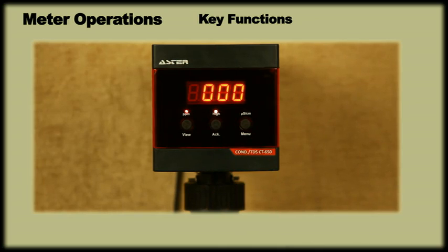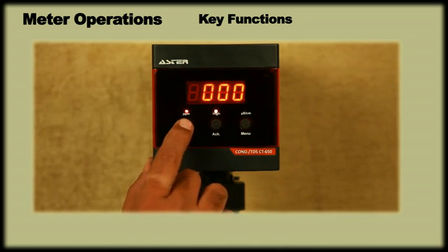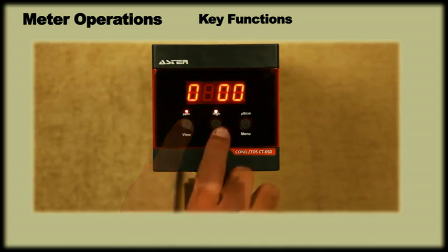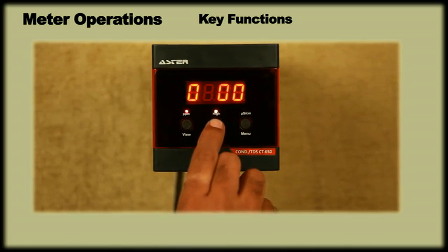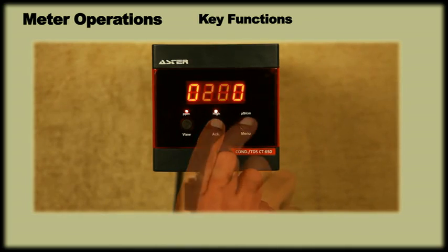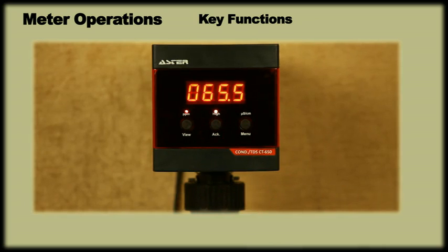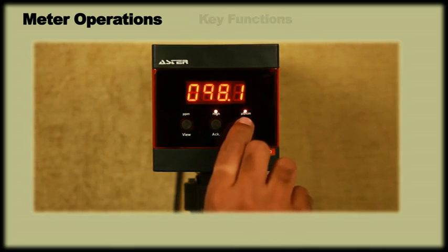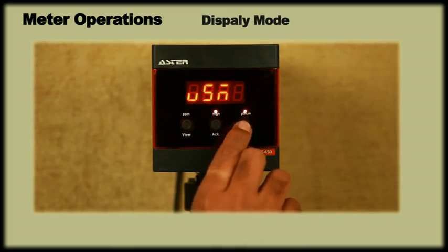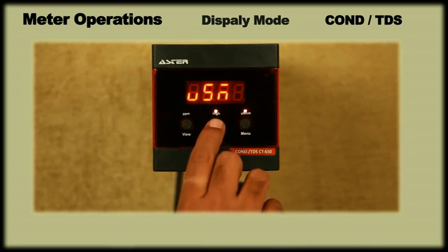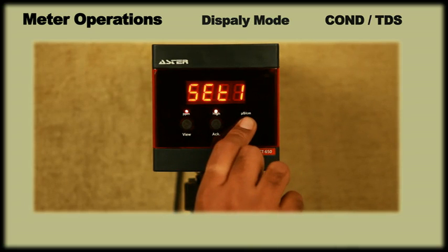While programming, the view key can be used to right shift, the ACK key for increment and menu key to enter and save the setting. Now, to select the display mode, press menu key twice. Select the required mode as conductivity or TDS using the ACK key and press menu to save.